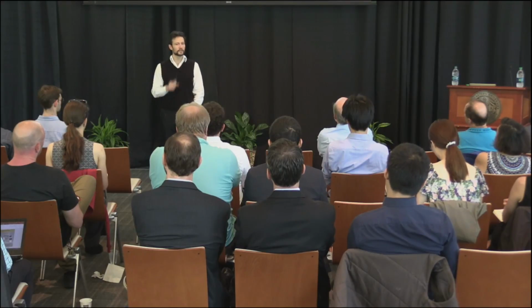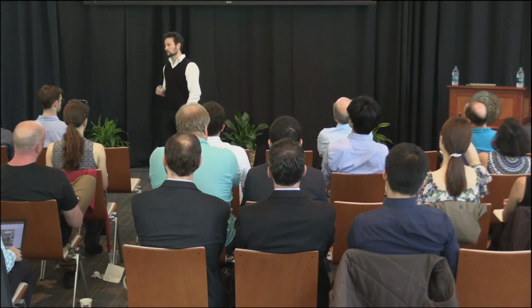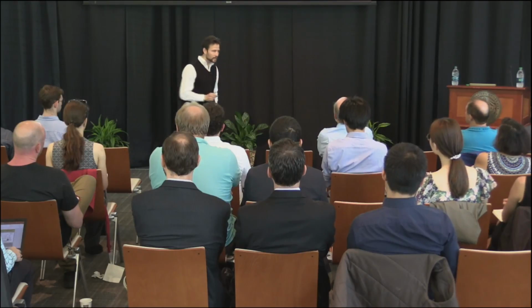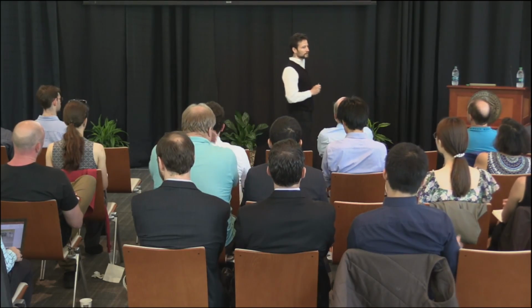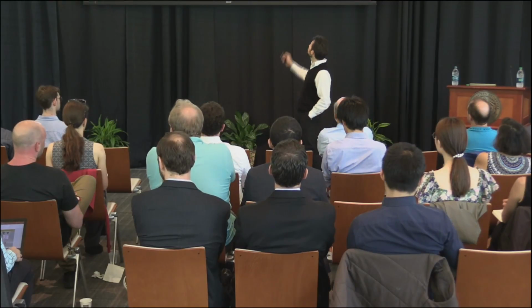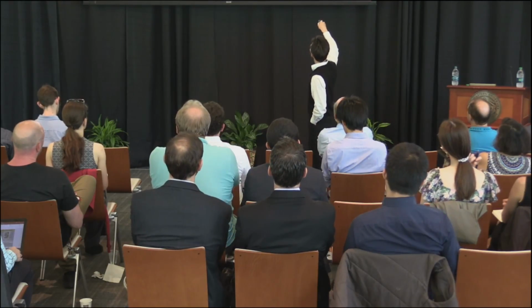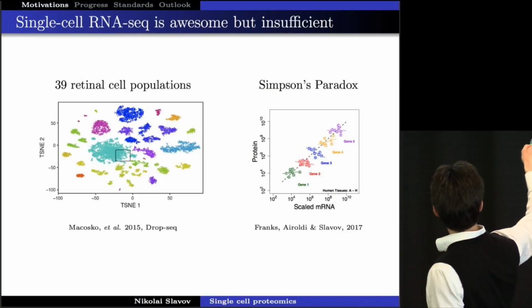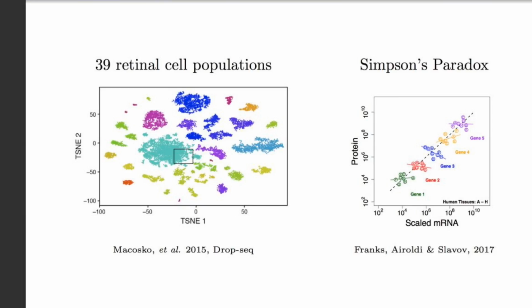Ribosomal proteins, tubulin, histones, they're the most abundant proteins in almost any cell, apart from red blood cells and some other special types. But most of the cells that build our bodies have the same set of very abundant proteins, the same set of very lowly abundant proteins. So if we just array together measured protein levels, and these data come from the draft maps of the human proteome efforts, we can get a fairly good prediction of the overall abundance for differences in the abundances of different genes. But then if we ask for any one gene in particular, for any one protein, how well we can predict the differences in the levels of that protein across different cell types or tissues, then our ability to do this prediction is much, much more limited.